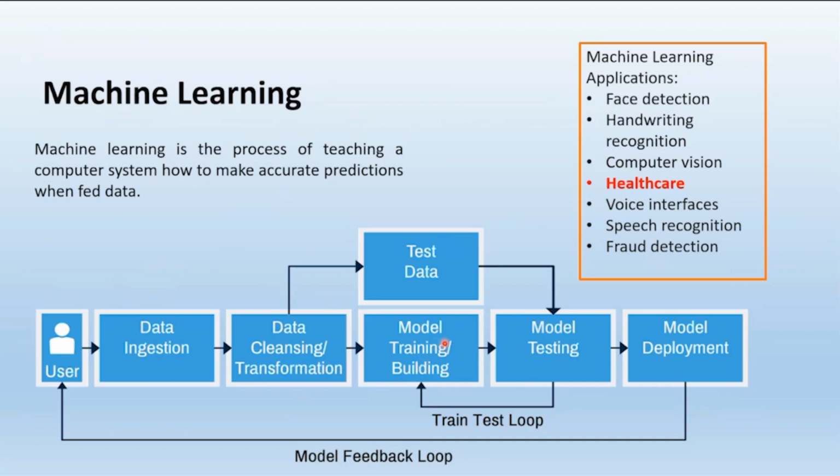A key part of this is you can't use small sample numbers. If you're trying to do machine learning on a small study set of, say, three samples per group, it's not enough data to really be able to test whether a model is sufficient. And so we're just under 100, around 86 samples. And that gives us enough to be able to split the data in half. And we can do this model testing.